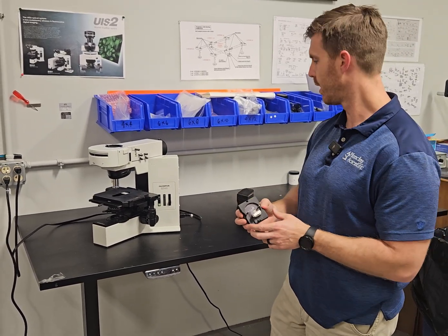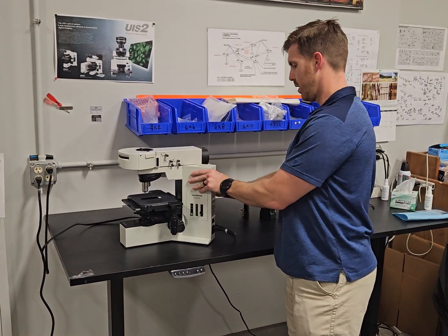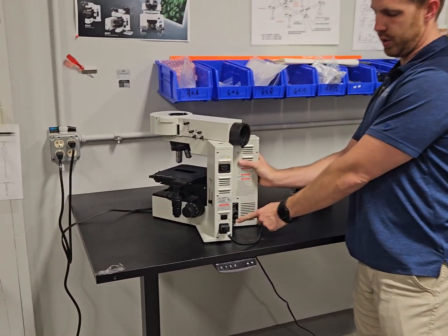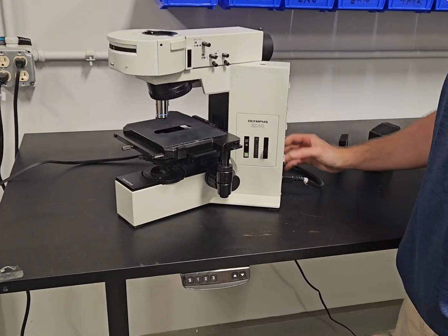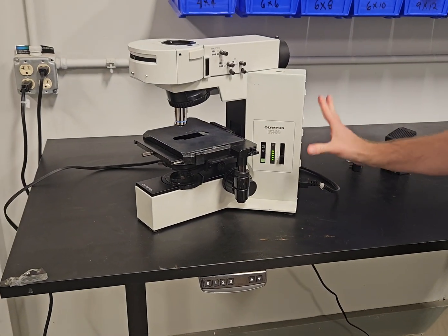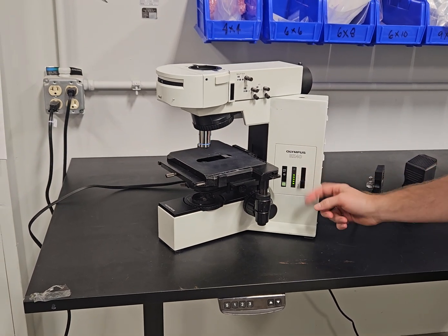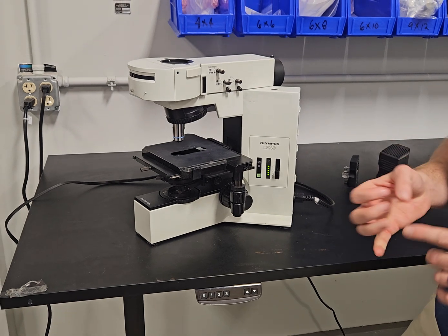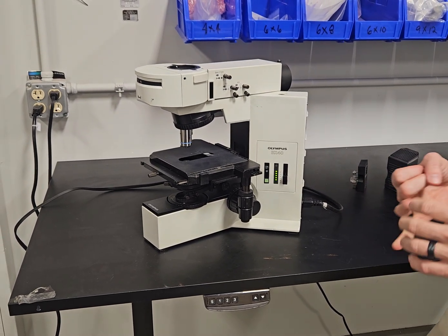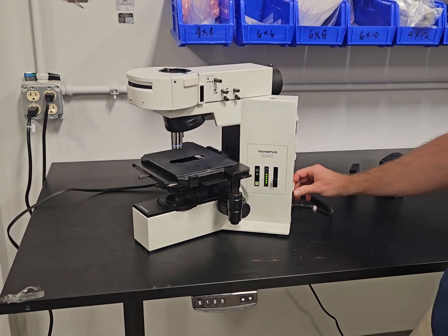It's a six volt, 30 watt bulb. So there are a couple of things you need to know. If there's no socket or no lamp house in the scope, or it's bad, when you turn it on — if the microscope's getting power — and you see it's all the way illuminated and you cannot change it at all, that tells you three things: your bulb's bad, your socket's bad, or you don't have either one plugged in.